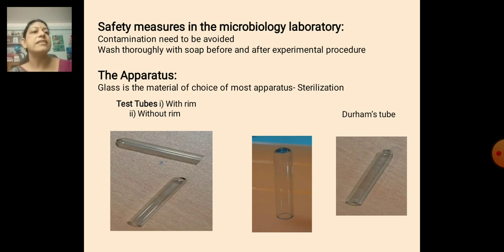Apart from this, there is a small tube you see, the name is Durham's tube. What is Durham's tube?